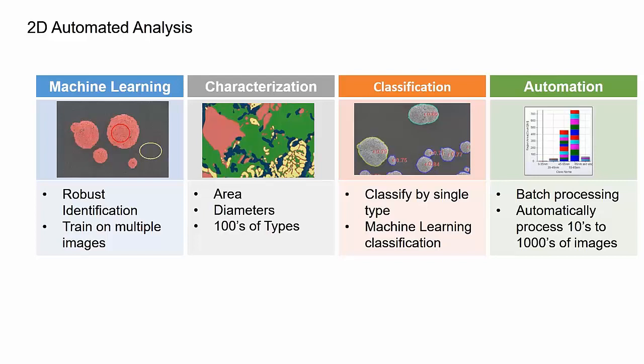The beauty of this, and the real importance of this, is it really leads to a much more robust identification of what you're trying to measure, where it becomes invariant to different shading. If you have some shading across your sample, for instance, and that may be changing as you're acquiring from different locations on your material, you can train machine learning to recognize only those areas where you run into problems with intensity thresholding.